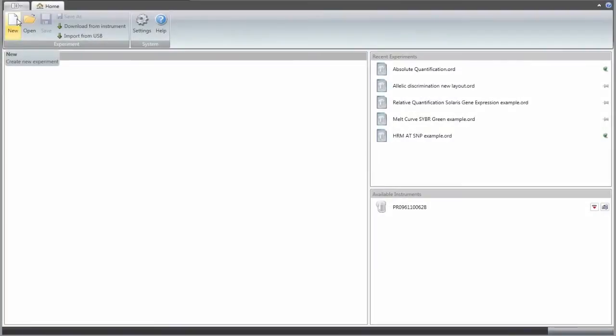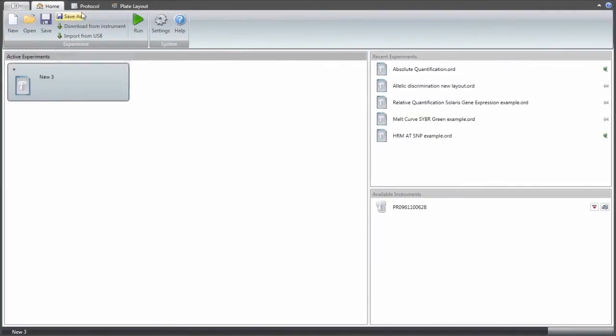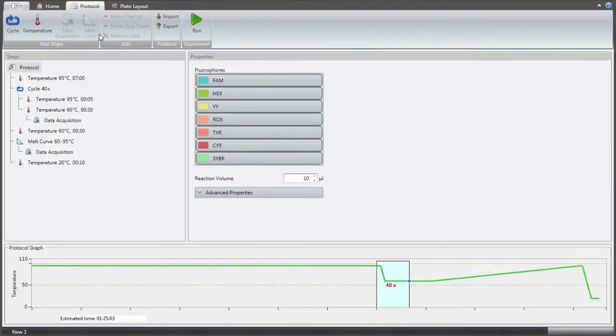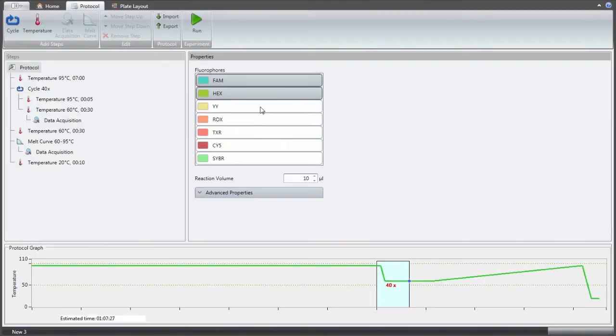PicoReal software has a modern interface with easy to use functionality. The software comes with a set of ready-made protocols that help in programming. Adding or modifying steps takes only a few seconds.